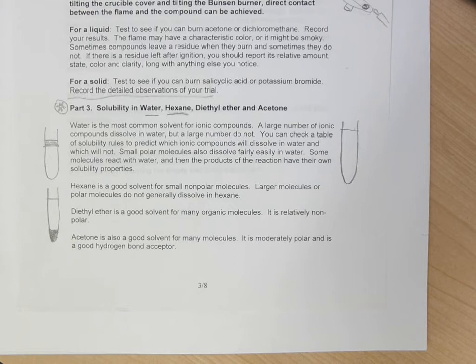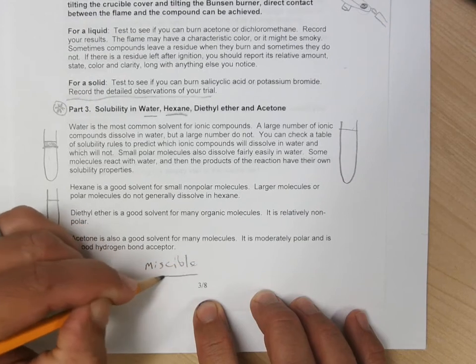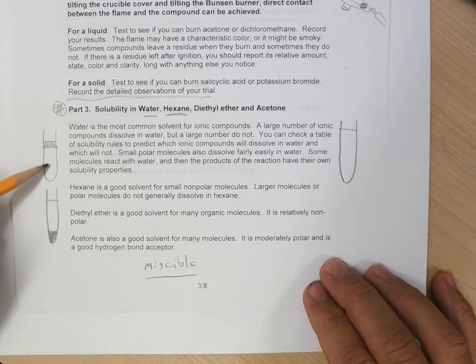Now the term that we're not going to use here, because we're not going to test for miscibility, is miscible. Many people use the term miscible anytime you have a liquid dissolving in another liquid. But if you're only throwing a few drops of liquid into a solvent, whether it dissolves or not is whether it's soluble or not.